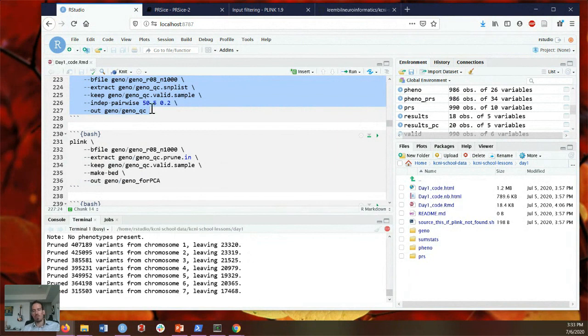If you have a very large window size, what it means is that we're going to be excluding genetic variants that may be quite physically far away on chromosomes, but actually have some long-distance linkage structure. That does occur. There can be quite complex linkage structure in that sense. By changing the window size to be quite small, we are actually preventing the removal of SNPs that are in very long-range LD. Sometimes that can be desirable.